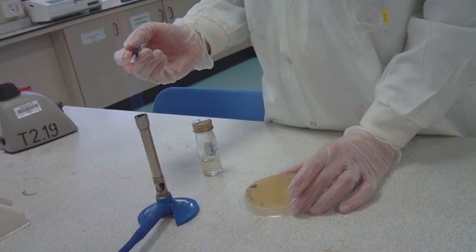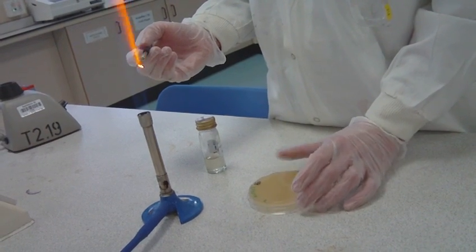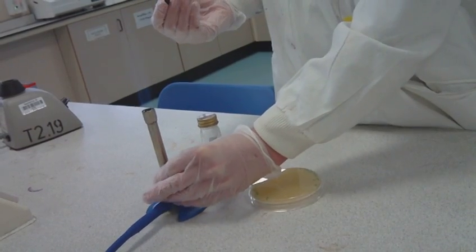Reflame the loop and sterilize before putting away. Turn the Bunsen burner flame back to safety and leave the agar plates on the side to be collected for incubation.